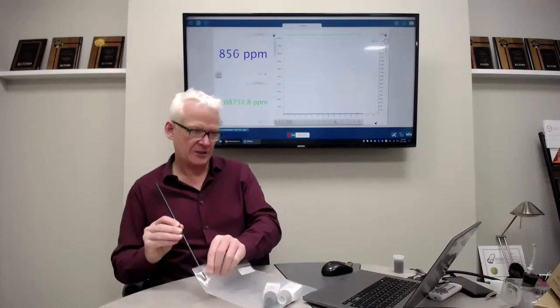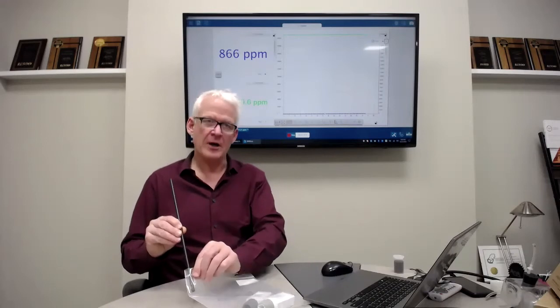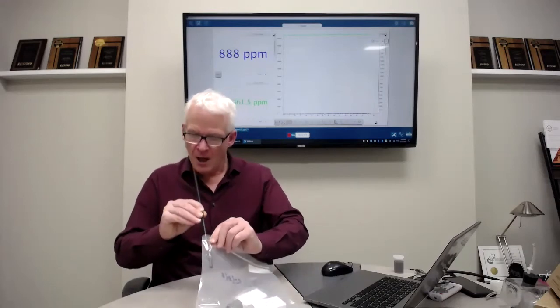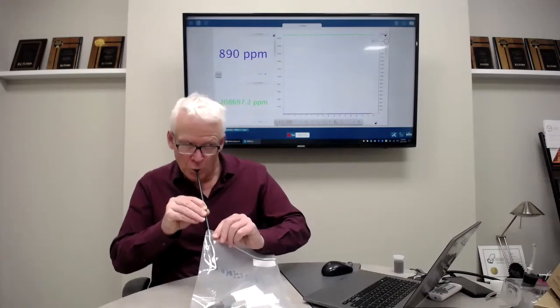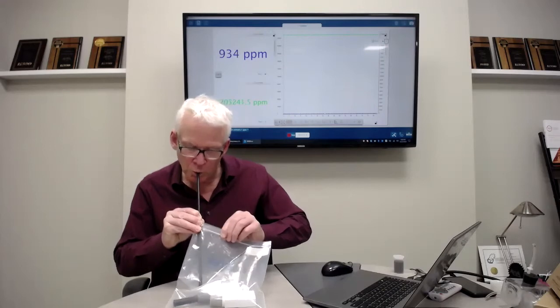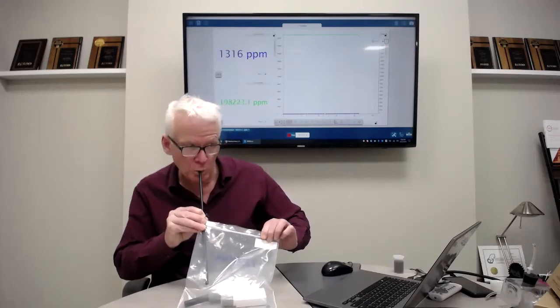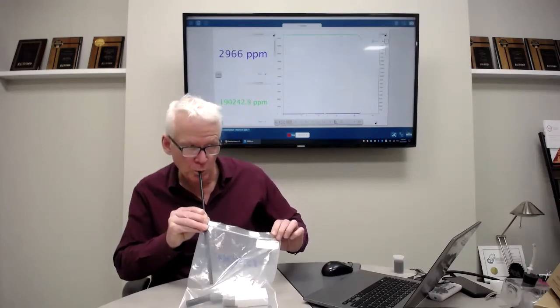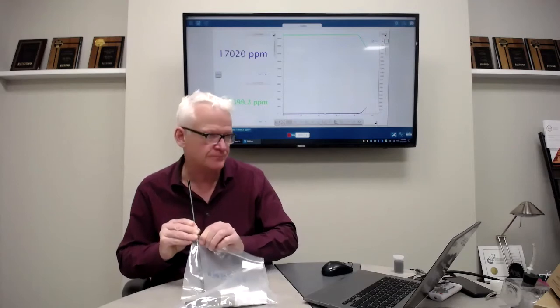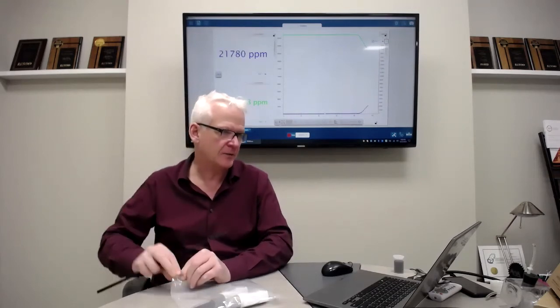Now I'm going to take a deep breath and blow out. All right, here it goes. And there we go.